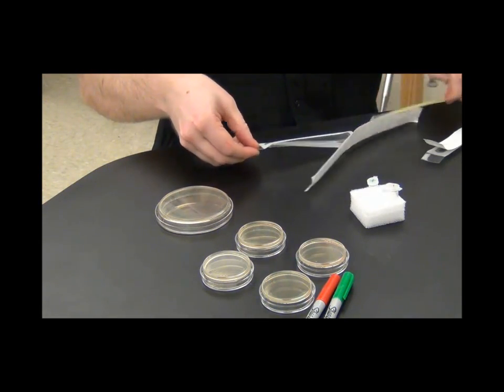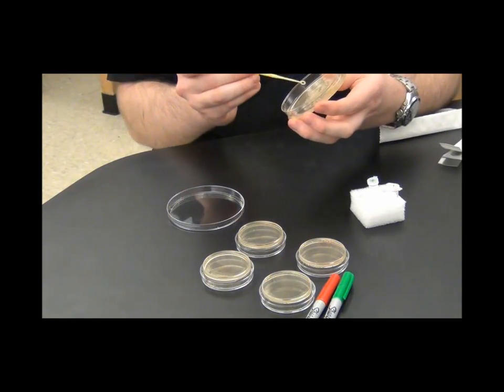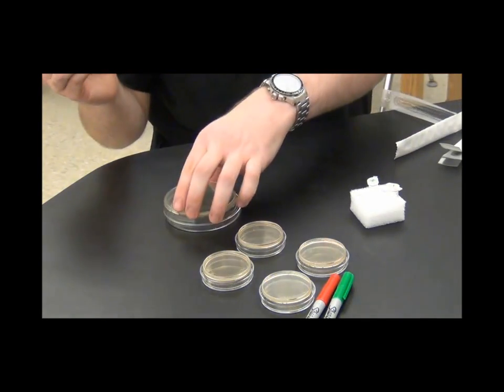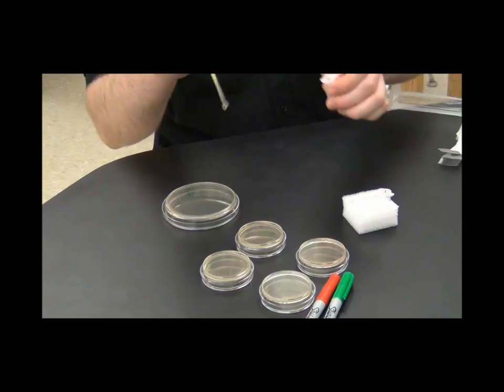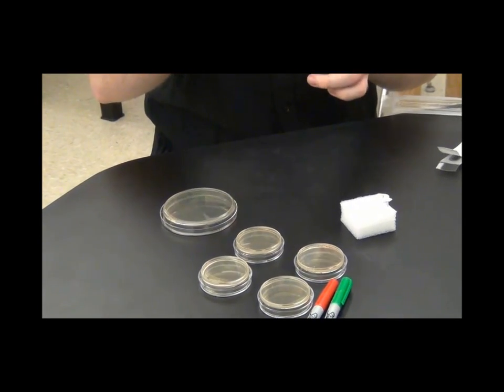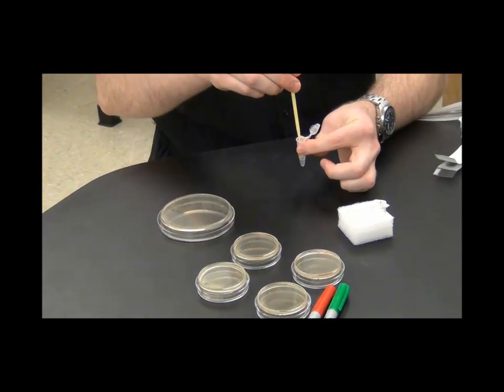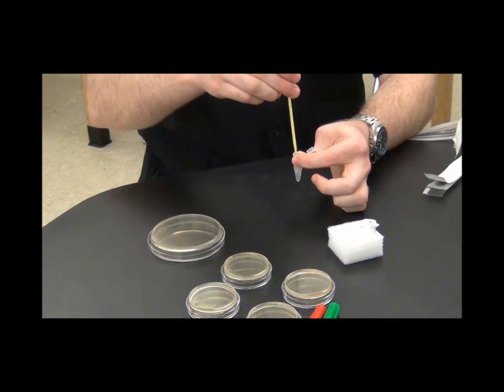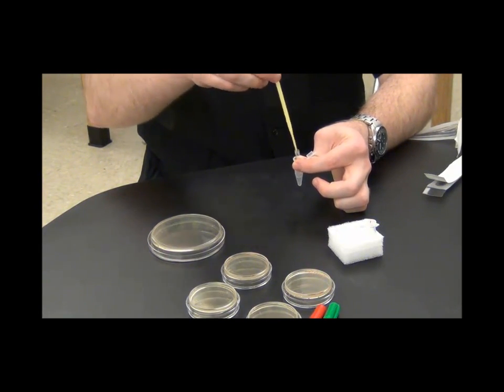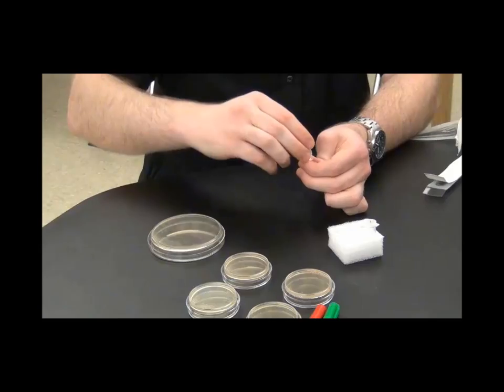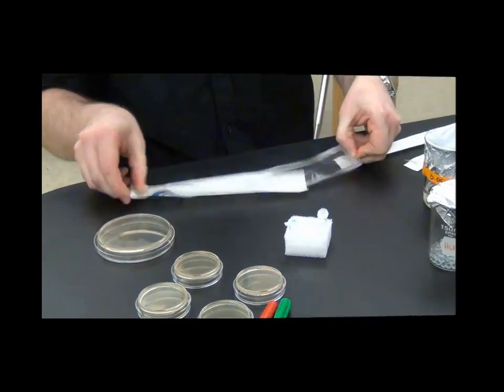You're also going to use your second loop to get another colony. You just want to scrape the surface of the agar. Don't gouge it and punch into the agar. And you're just going to add the bacteria to the other tube. Again, twist to make sure the bacteria falls off. You should see a little clump of white in the tube. And throw your loop into the disposal container.